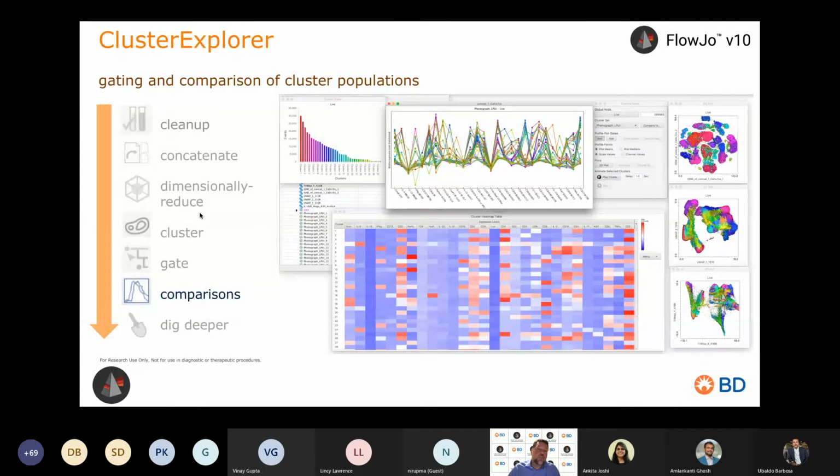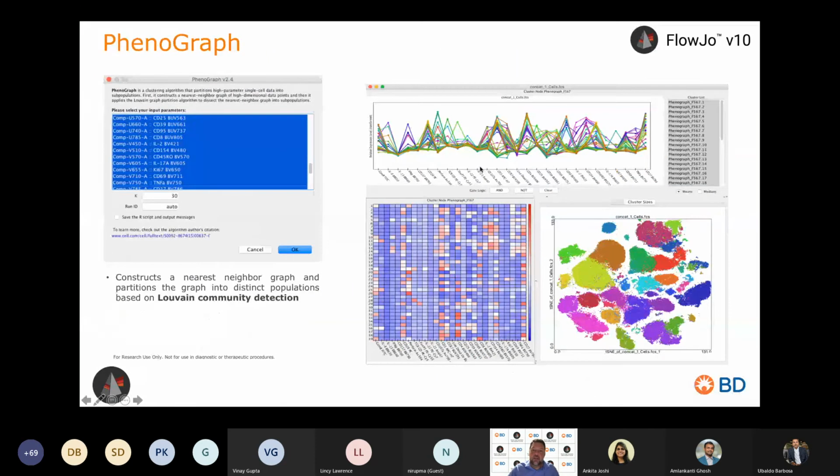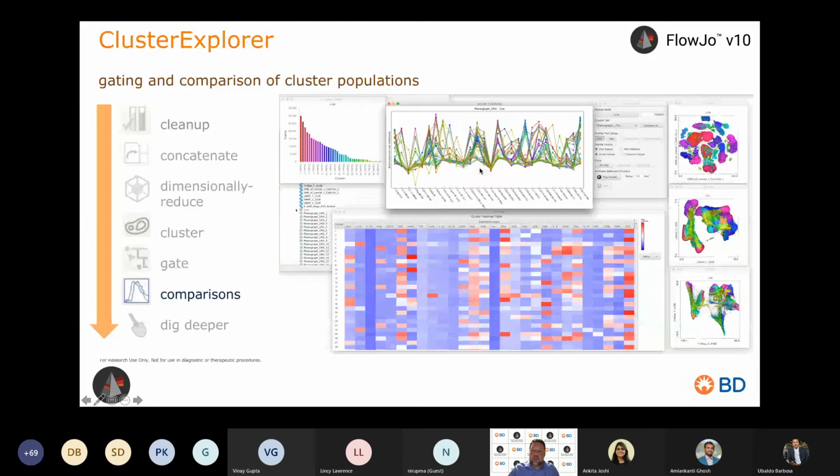No matter which method you use, you can spin up Cluster Explorer, and we've done a new release of Cluster Explorer recently, so it's been modularized into distinct windows, as Amlan showed you in his demo. It doesn't look like a single panel the way we had it a while back. Now you can close and open these windows if you need to. You can make as many 2D plots as you want. You can compare these different dimensionality reduction methods and choose different cluster sets from your control panel here. And I'll show you that in just a minute.